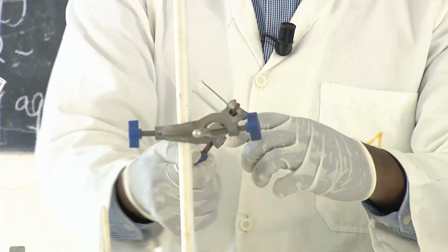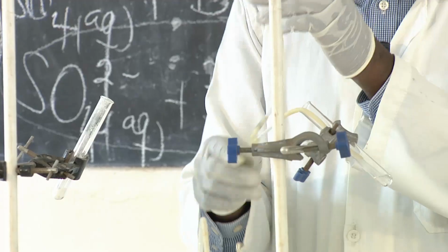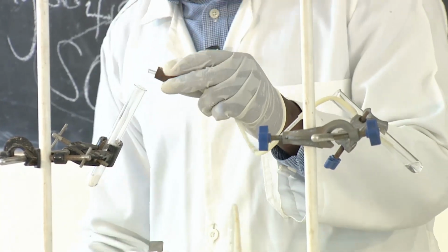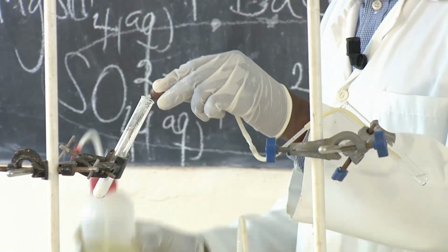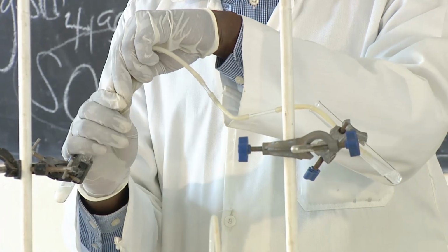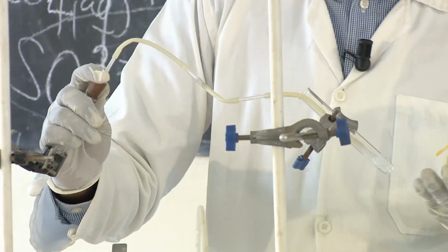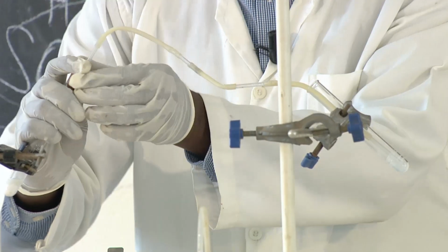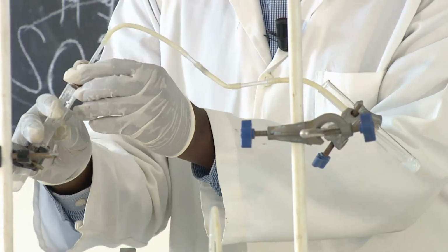And then what we do is to pass the gas into this lime water. So that means we are using calcium carbonate reacting with the acid. So this is the acid. We are adding the acid. You see the gas is passing here. This is effervescence, as I've said. A milky solution is forming. So we need to pass more gas.